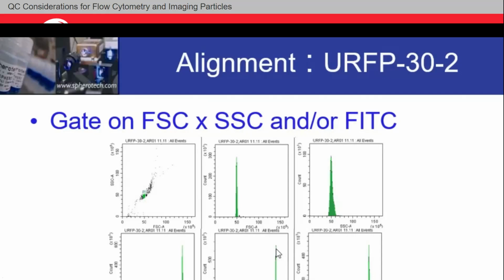Because it's usually, like I said, the best technology is usually mimicking biology. It's usually not that everything's going wrong. There's a chance that it's just one filter. There's a chance that maybe one of your lasers needs to be switched out. There's a chance that maybe somebody ran your flow cytometer until it went dry and let it go much longer. You always want to make sure that there is a wet tube on your flow cytometer, especially if it's running. If you let it run dry, that could be causing some issues. All right, but you want to be able to troubleshoot this.